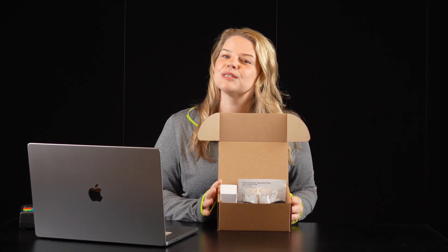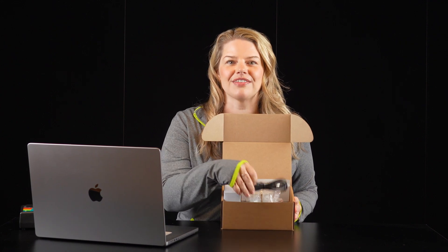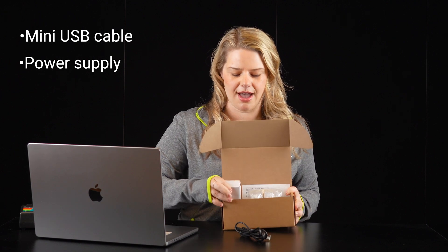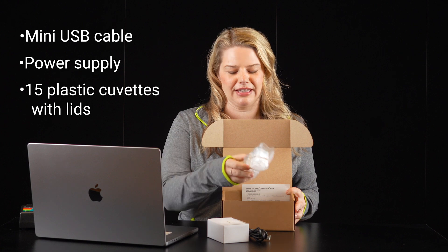I'll start by unboxing my new device. In this box, you'll find your GoDirect SpectraViz Plus along with a mini USB cable, a power supply, and 15 plastic cuvettes with lids.